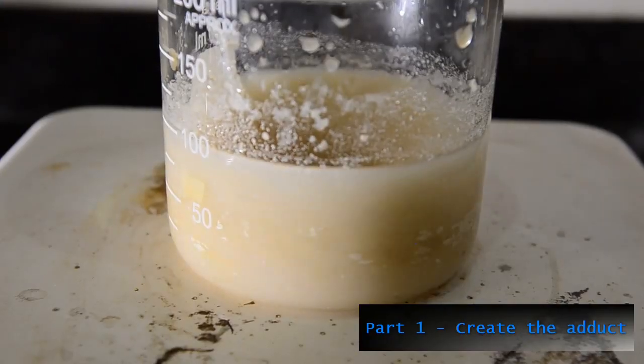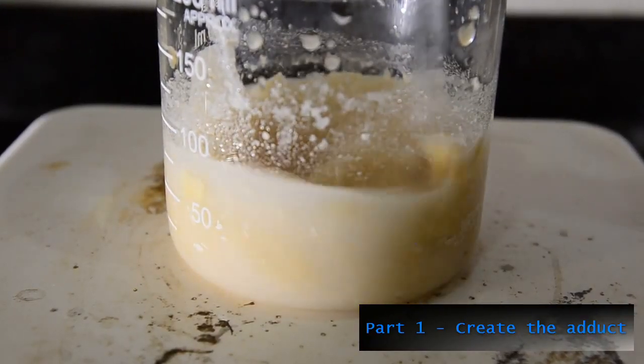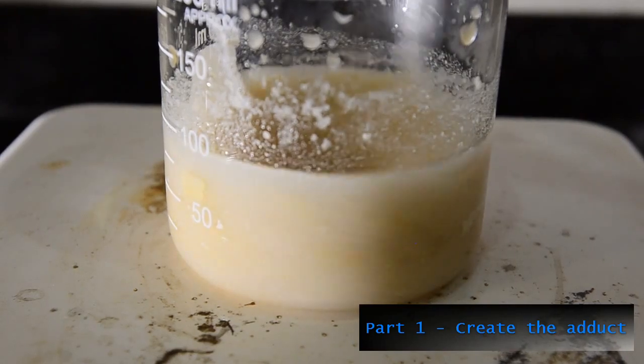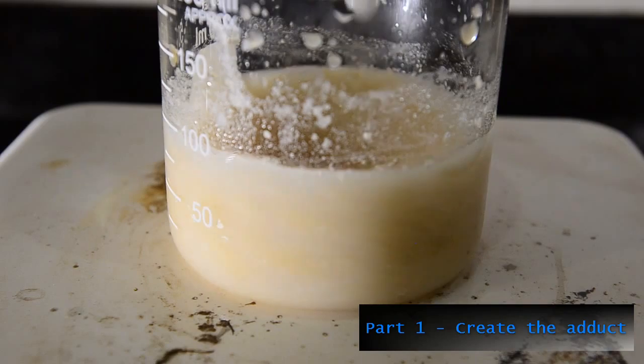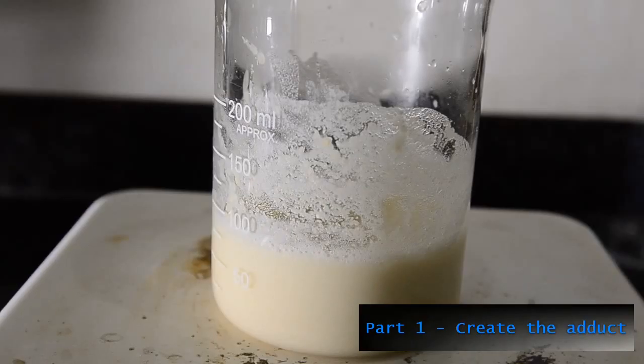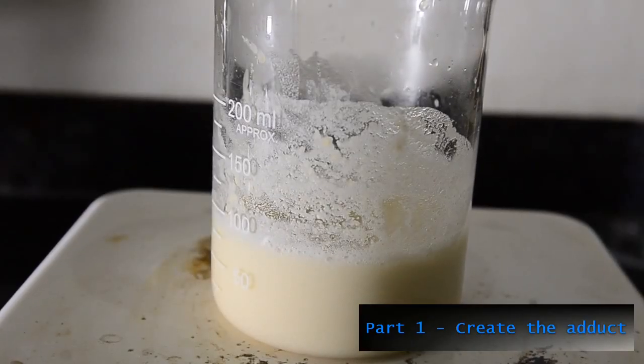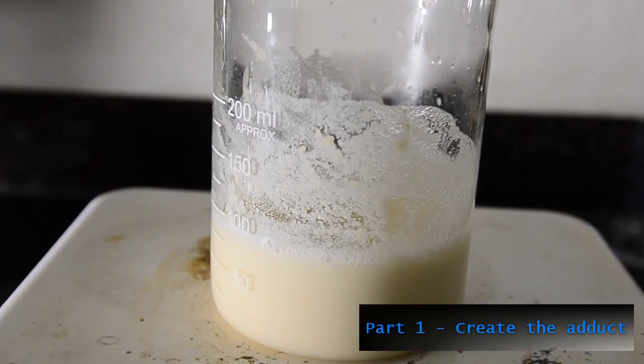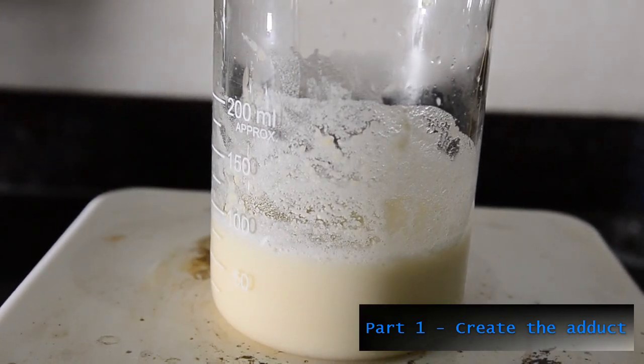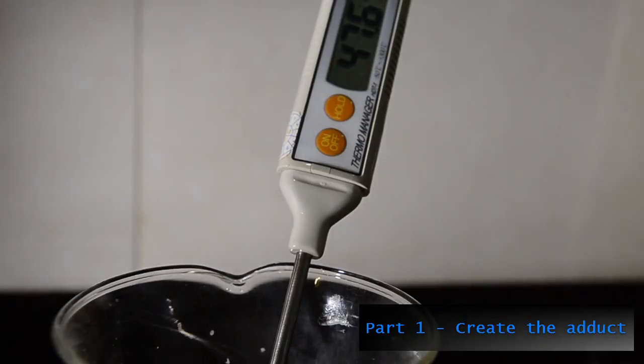Once formed it's very important to use a spatula to break up all the lumps in order to ensure all the benzaldehyde reacts. Spend some time doing this properly. Keep stirring for at least 15 minutes and breaking up the lumps and you should end up with a very fine precipitate like this. Once completed you'll notice a quite significant temperature increase.